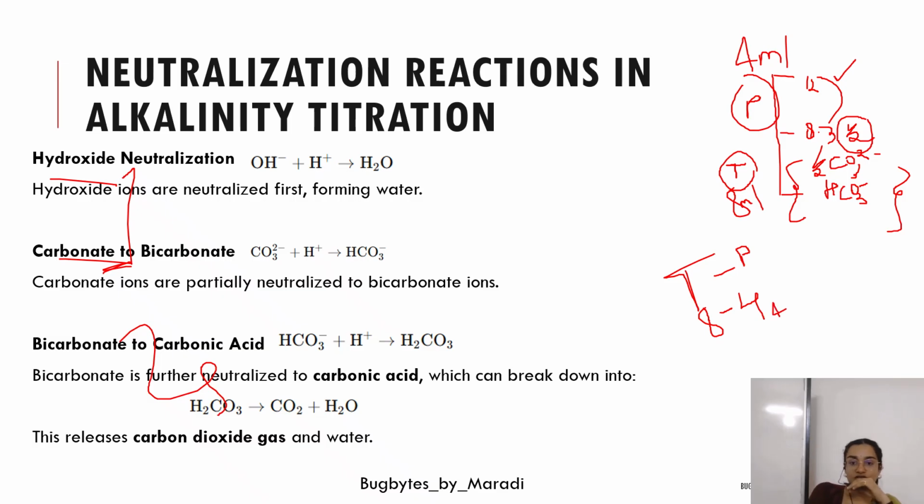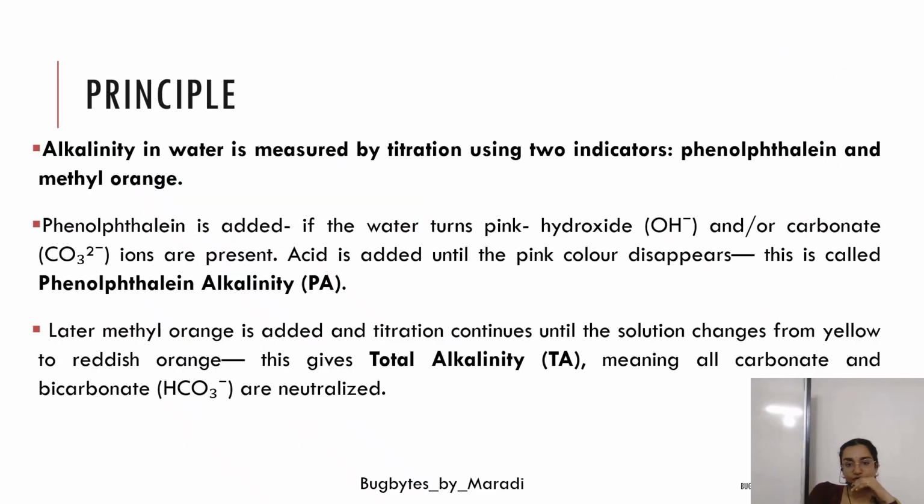But you should remember that not all three, bicarbonate, carbonate, and hydroxide, will be present together in a water sample, especially hydroxide and bicarbonate. Hydroxide reacts with the bicarbonate to form carbonate. That's why not all three ions are present in the water sample at the same time. That is important. So we'll go to the principle.